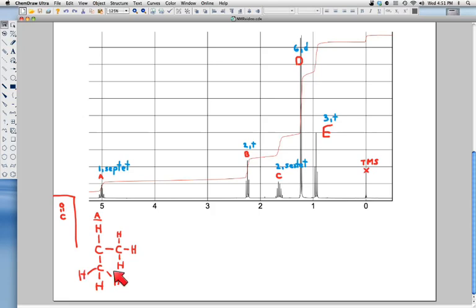And now clearly we see that for our peak A, I have 3 neighbors there, 3 neighbors here, a total of 6 neighbors and 7 peaks. What I like to do here is draw a little squiggly line, and that tells me that this is a piece I just made. So we're really done looking at peak A. Looking at our spectrum, I'm just going to cross this off.